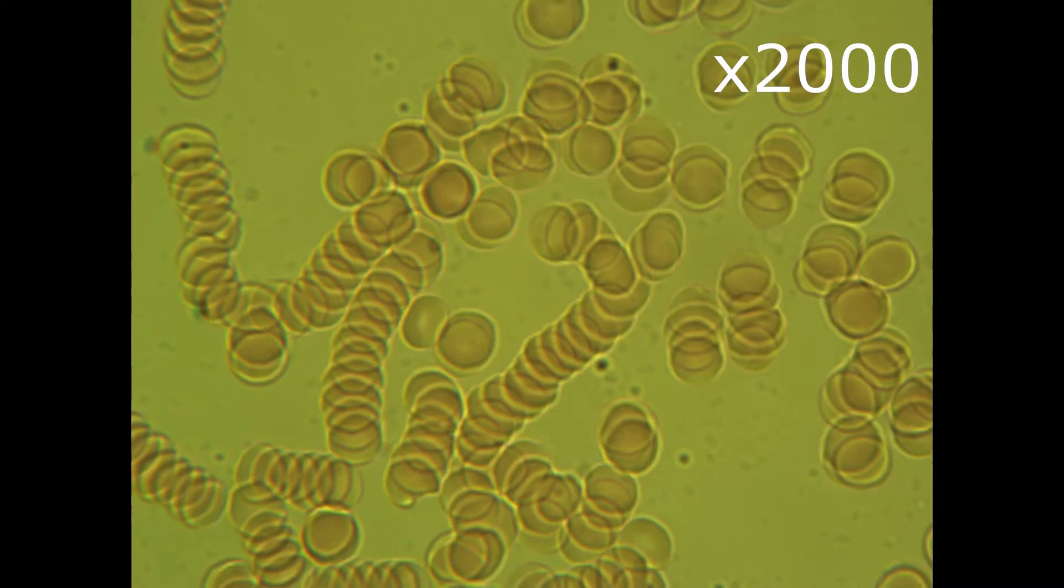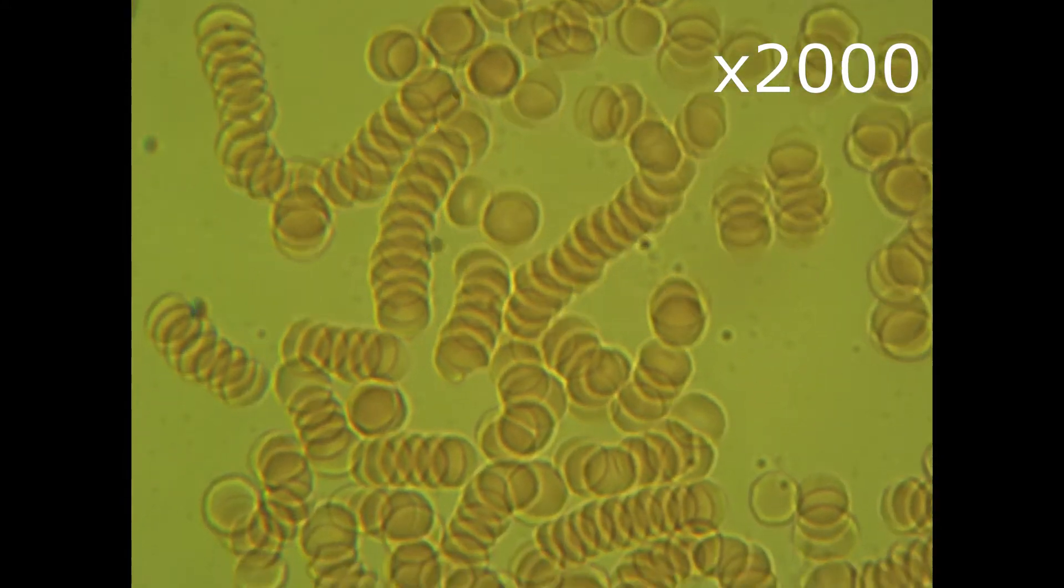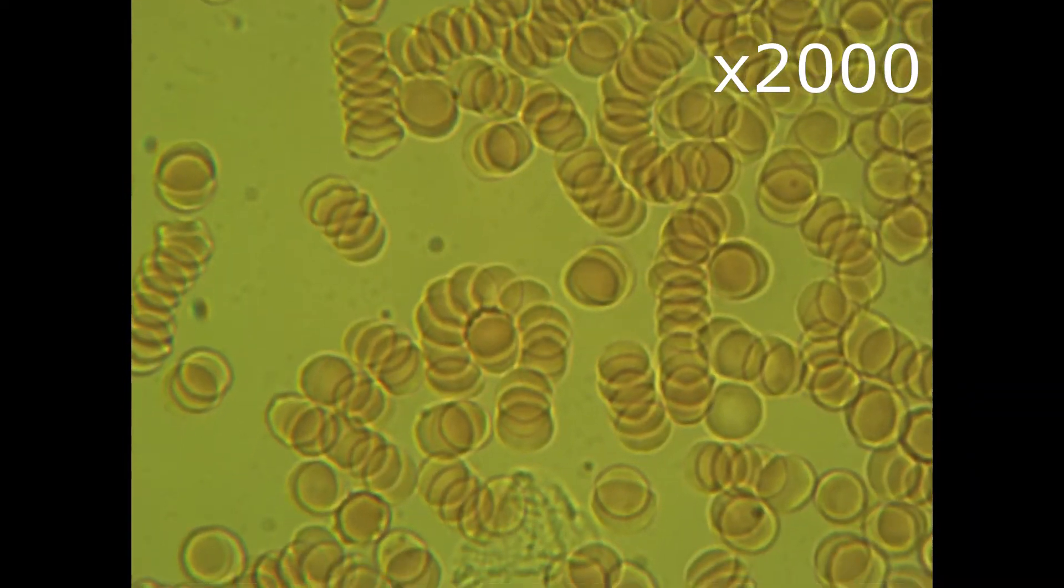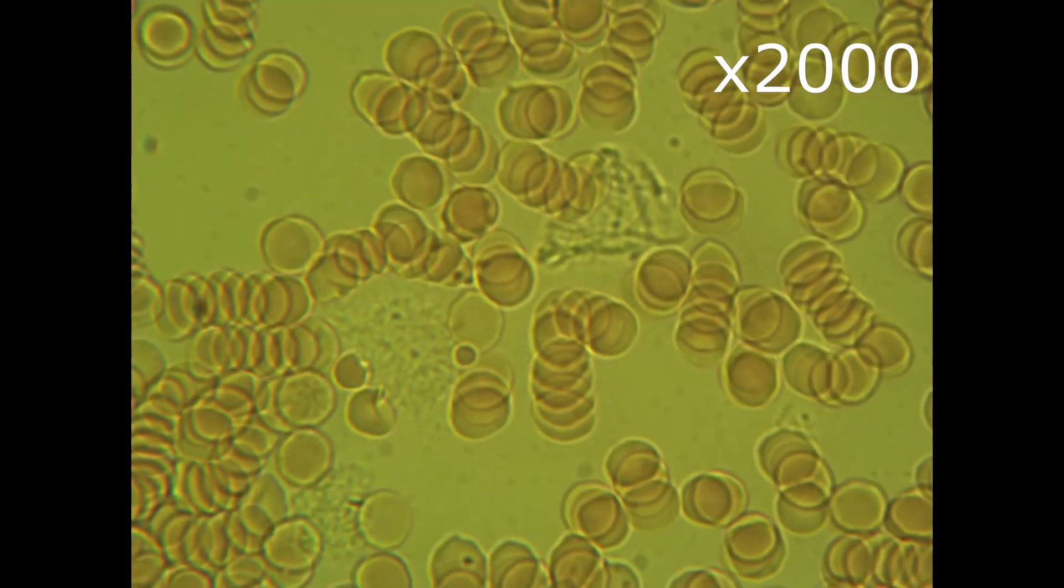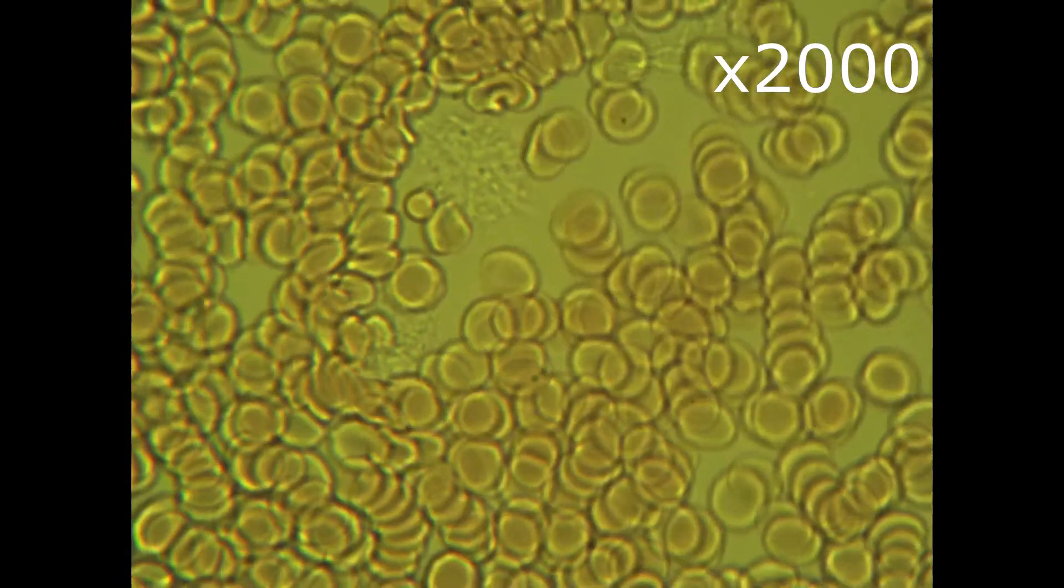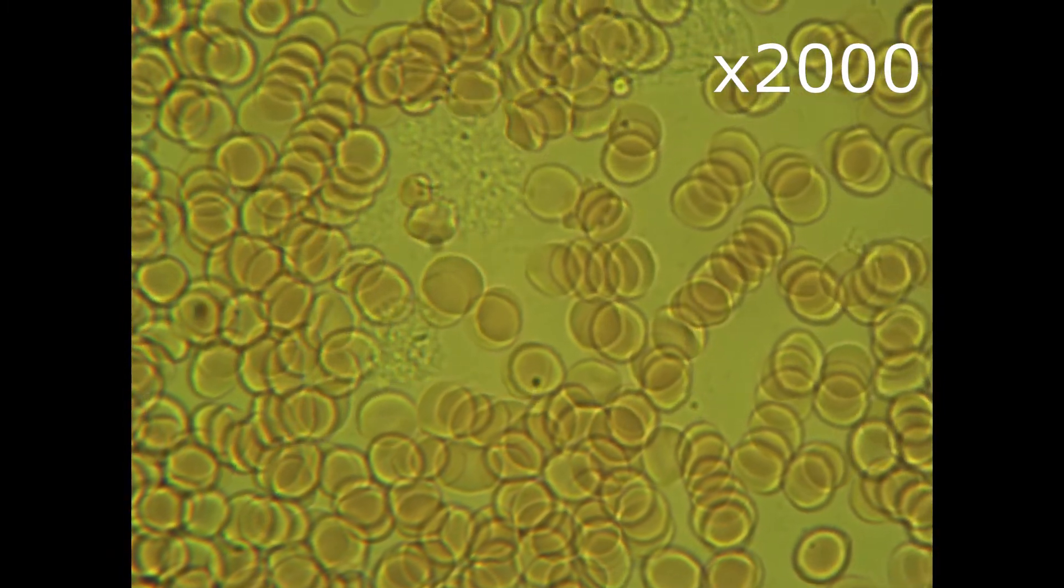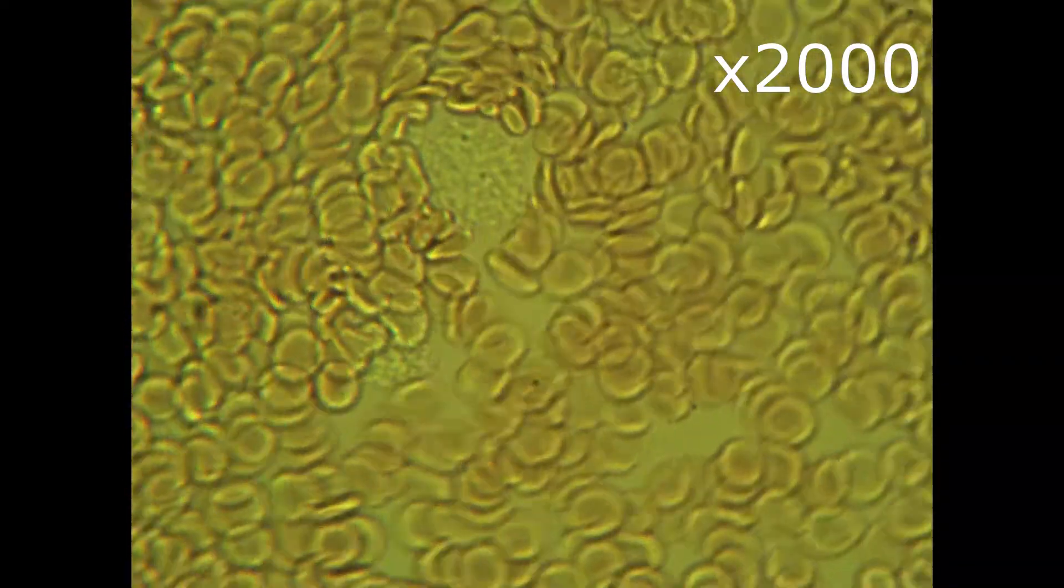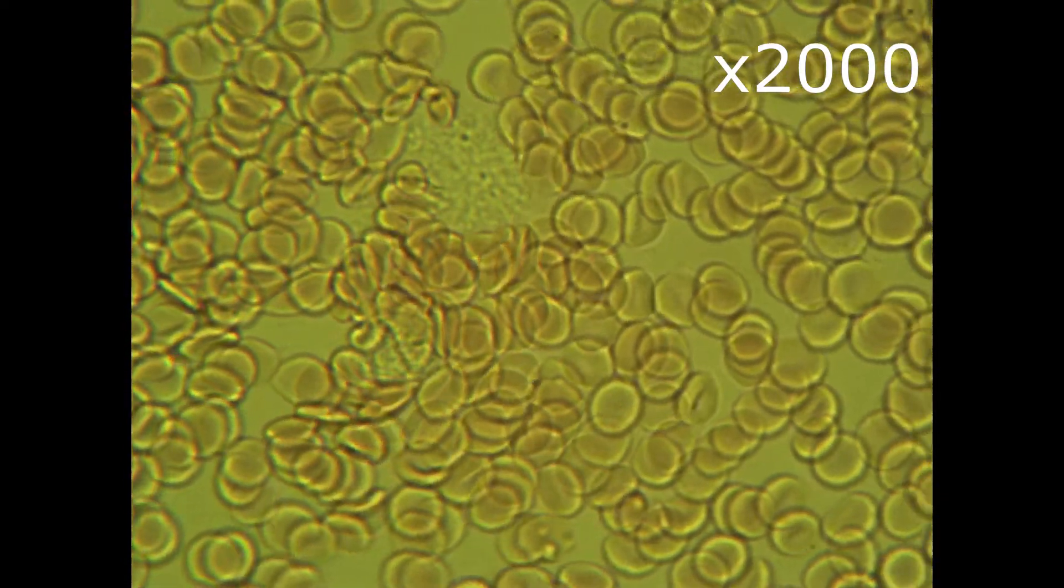Let's zoom to 2000 times. In this view, we can observe the real size of the chains and how they are grouped together. They are quite long. Let's try to move them. I have noticed something that I haven't seen before. Blood flows as a river. In previous experiments, red blood cells didn't flow together. I am happy how it flows.